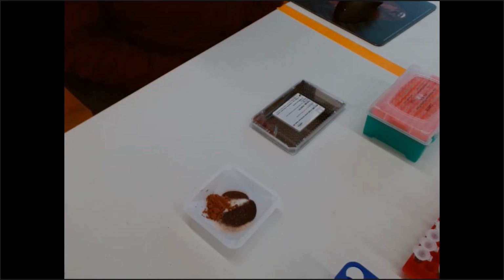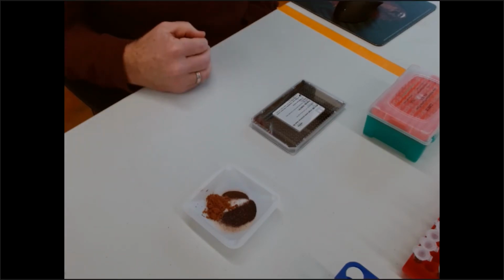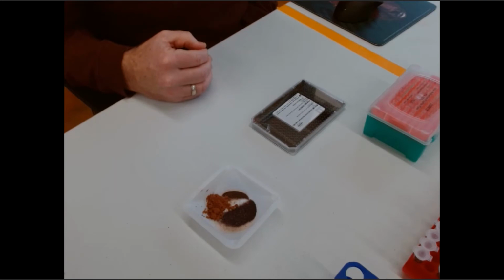And I present it this way just to demonstrate that even though these are all grapeseed extracts, and they all have been analyzed and demonstrated to have the characteristics that are inherent of grape seed, these products and samples can be received and look very different. They're different ingredients by different manufacturers with different structural properties.